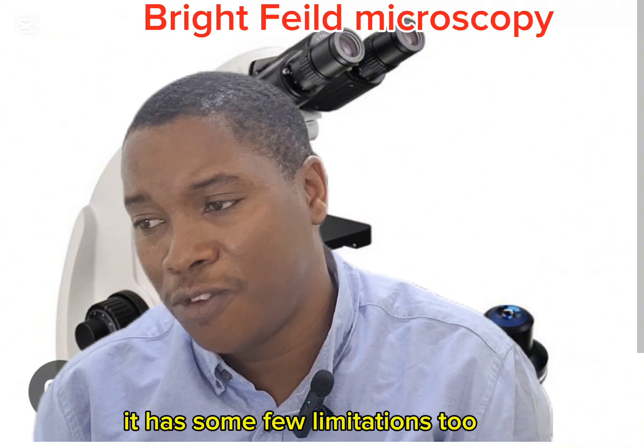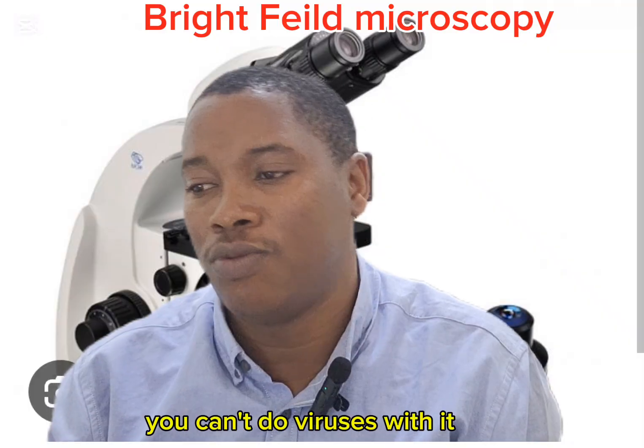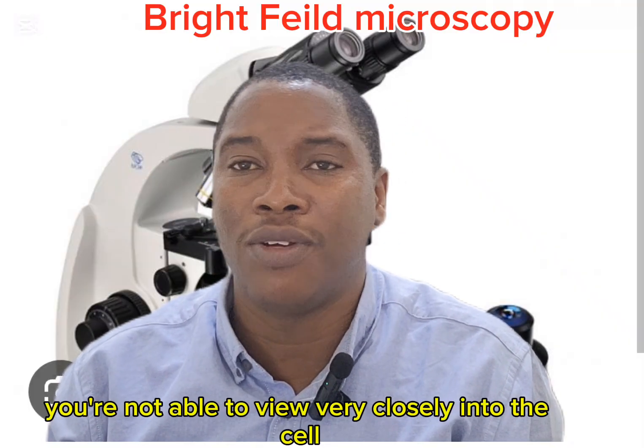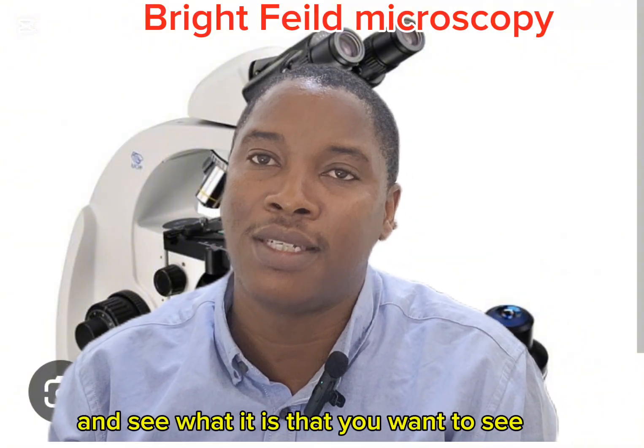It has a few limitations too. Some of the limitations are that you can't view viruses with it, and sometimes the contrast is not good enough. You're not able to view very closely into the cell and see what it is that you want to see.